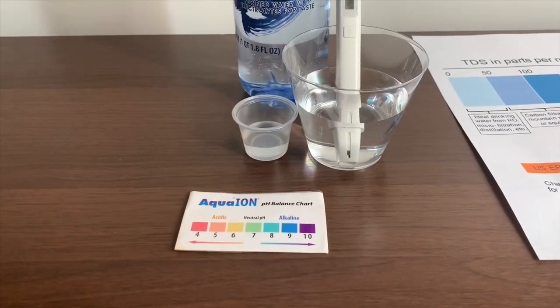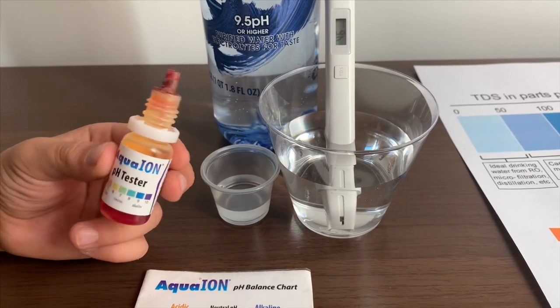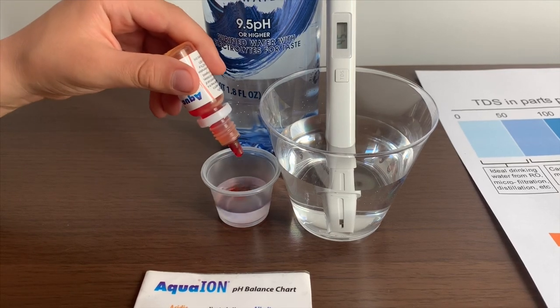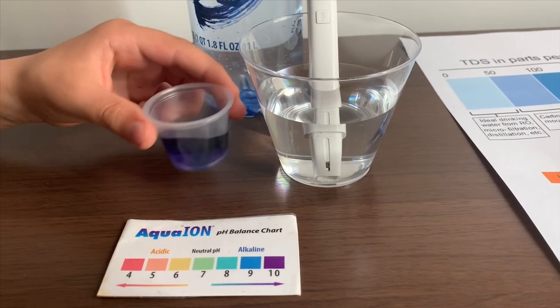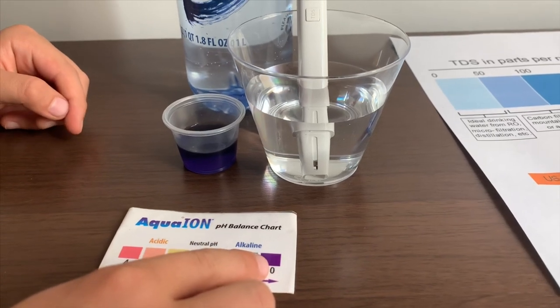Now let's test the pH level. If you want to buy this pH tester, check the link down below. We're going to do two drops. Let's stir it a little. I give this a 10 — this is alkaline water.